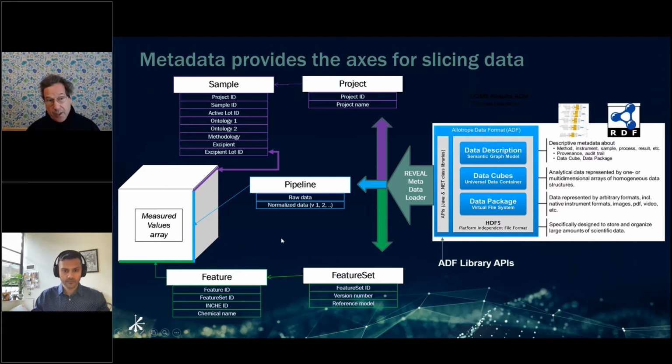And so, with SciDB, we're not talking about individual files worth of experiments, right? We're talking about wanting to aggregate 10 years of data or 3 years of data or a year of data even into SciDB. So we're really at that next level up from the other analytical platforms that I've been discussing.